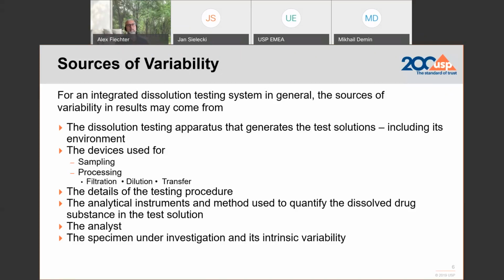You have your validated procedure. You follow those validated procedures from A to Z. So it is the case with the PVT. You have a test protocol that you ideally follow, very close to what is required, and only then are you really able to assess any results that you obtain from that PVT test to the certificate that is giving you the ranges and limits of what you are supposed to achieve.